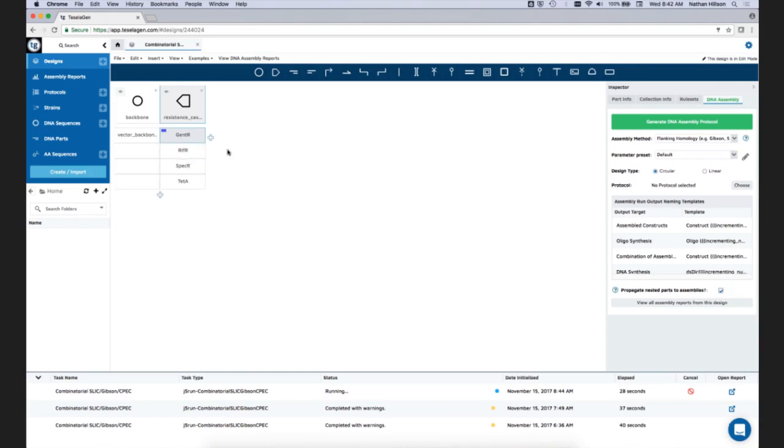As DNA synthesis prices become increasingly competitive, the skew is going to be increasingly towards just getting it synthesized rather than doing PCRs yourself. And then after it decides on the general strategy, then it might be designing all of the synthetic fragments for you, the DNA oligos, worrying about are there any incompatibilities between pieces and so on. So that's basically what the software is doing.